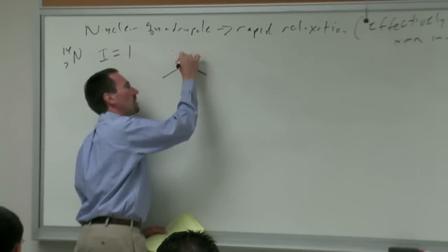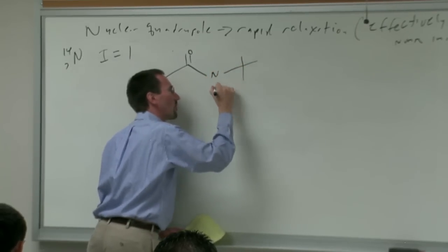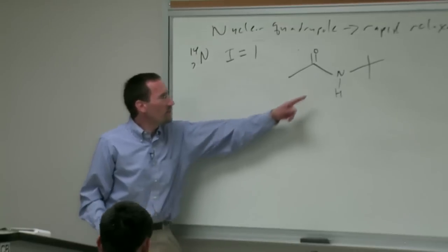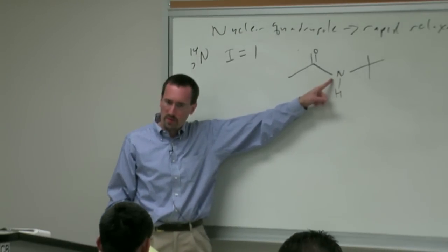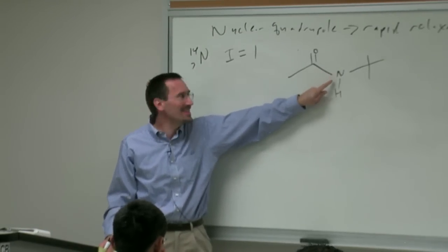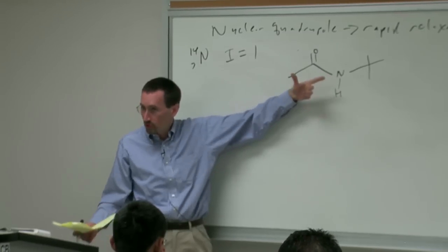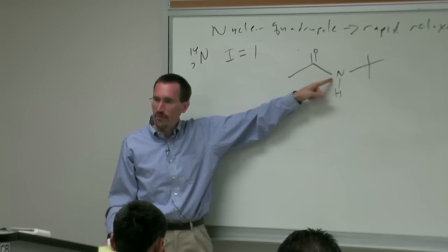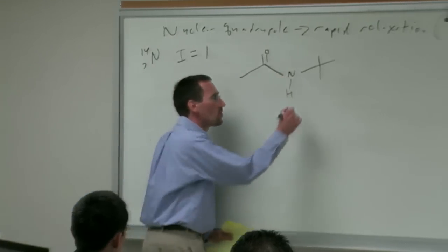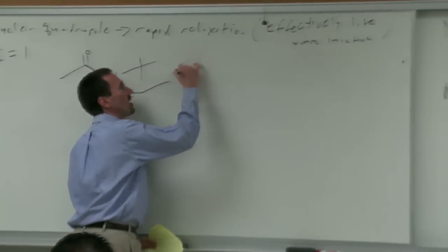So for example, if we come to that amide, what we were dealing with before when I asked you about the IR spectrum, and if we look at the NMR spectrum of this amide, of course, most of your nitrogen, 99.62% of your nitrogen, virtually all, is N14 in here. And we don't see J coupling to this proton.